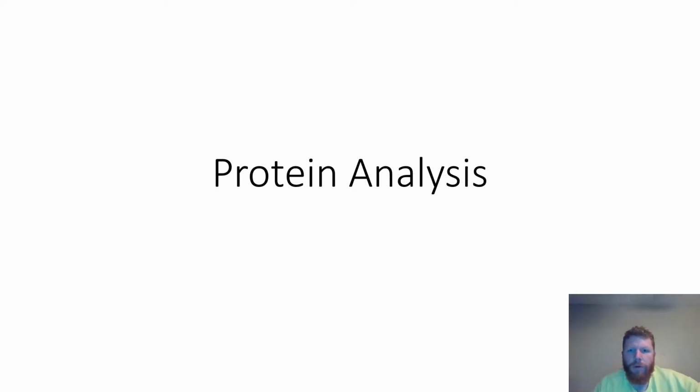Good afternoon, everyone. Today I wanted to catch us up on the discussion of, I believe it was February 25th. It was Monday the 25th, and some of the things that we talked about in lecture on that day. So the two main points were protein gels, so SDS-PAGE versus native PAGE, and then I wanted to follow up with a discussion of molecular scissors. So go ahead and please pay attention.